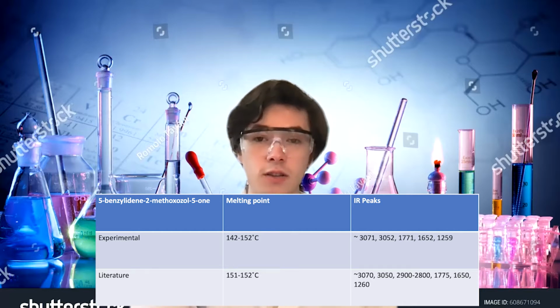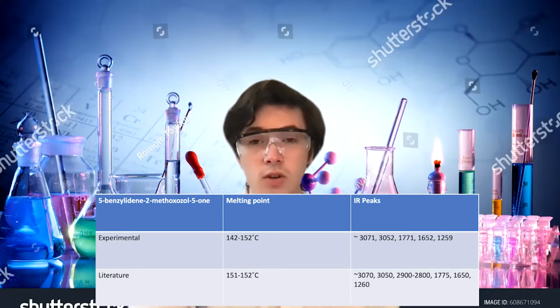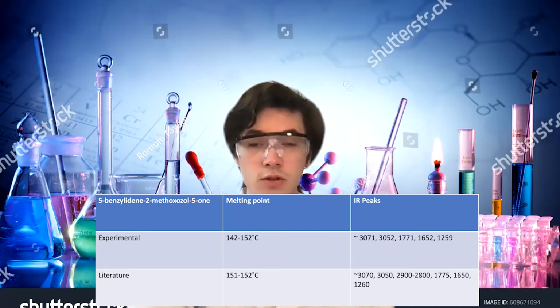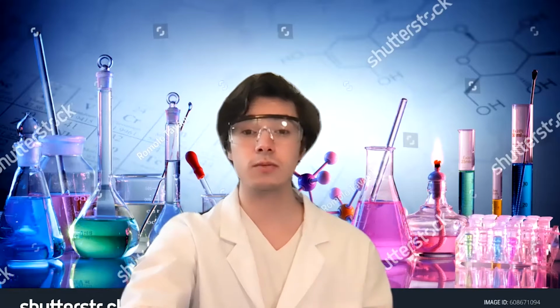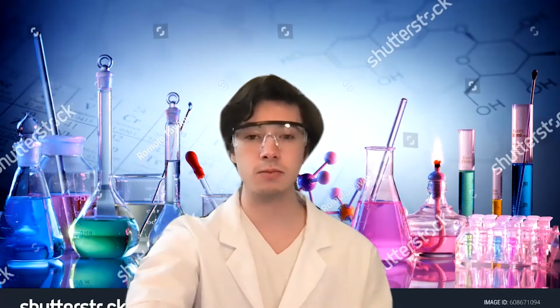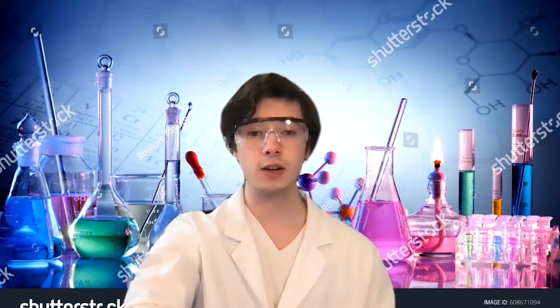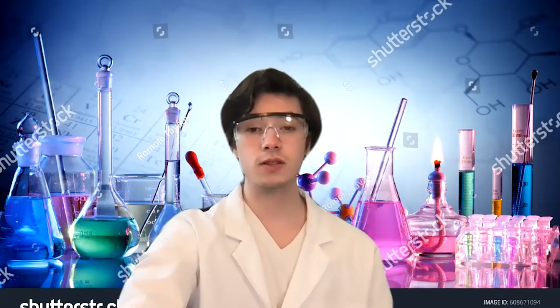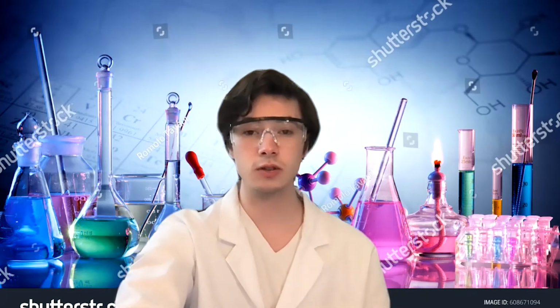on the literature IR, there seems to be a broad signal between 2,800 and 2,900, which usually corresponds to an sp3 hybridized carbon-hydrogen bond. Given that the reaction has not come to completion, that is probably why we are missing that sp3 hybridized carbon-hydrogen bond. So overall, it looks like we have almost fully synthesized our product with some contaminants, and the reaction might have not fully gone to completion yet.